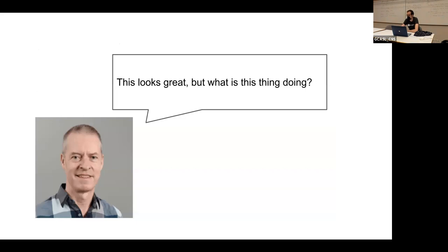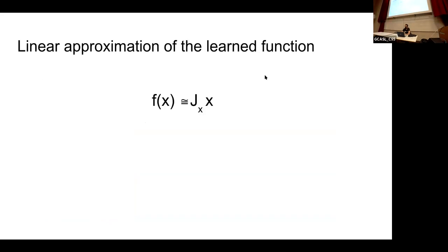But we also tried to do some analysis to show them how the network was denoising. This is based on a Jacobian analysis. Let's think about each individual pixel, because that's easiest to think of. We look at each individual output pixel and see what its dependence is on the input pixel. Now we can think about the gradient of this function, meaning the direction in which, if I modify the input, the output pixel changes the most.